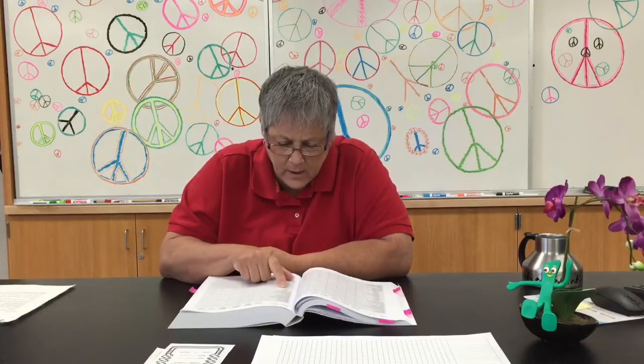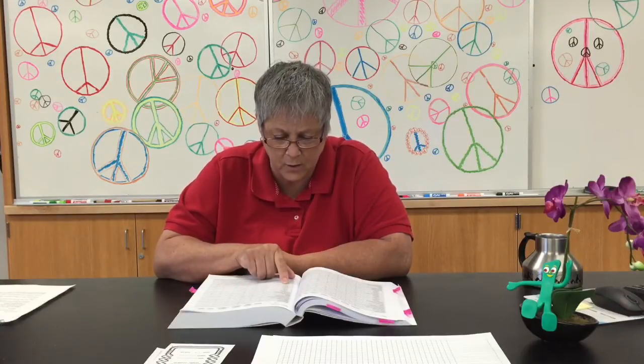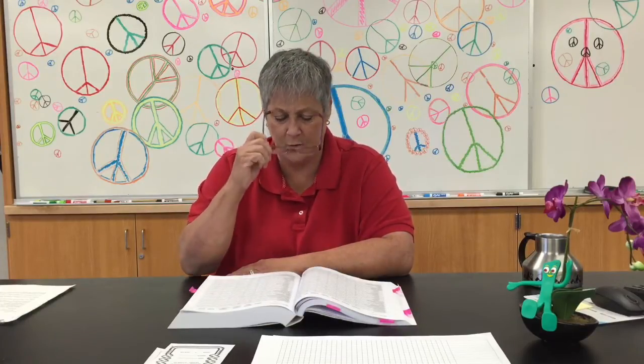Going down that list, lactose is there. Maltose, we do not have maltose, and that has nothing to do with the starch test, so just ignore the maltose. D-mannitol, that's the mannitol test we used. And then finally for carbohydrate tests, the sucrose test. Right, continuing down the list, the nitrate reduction test. That's the nitrate test that we did in lab, and that's just the first part of the test. Was the organism able to convert nitrate into nitrite? All right, so that's what we mean by the nitrate test.